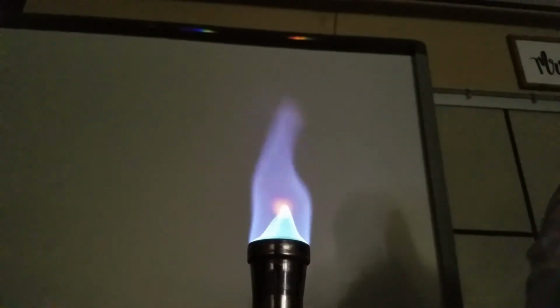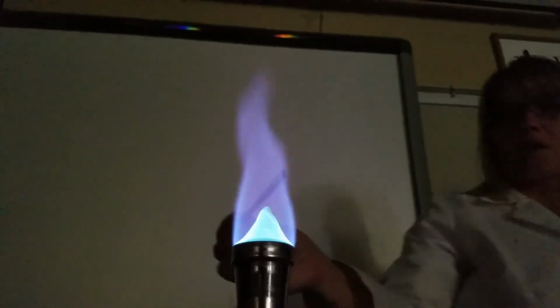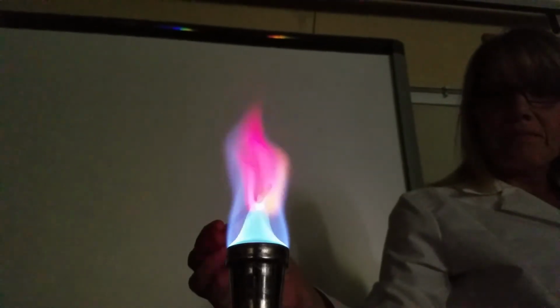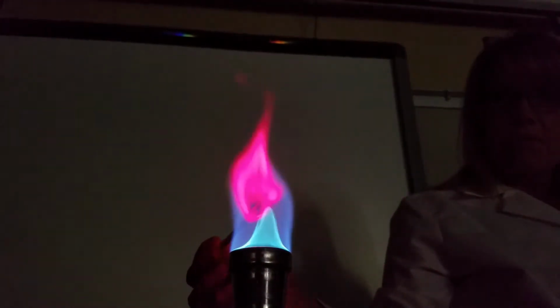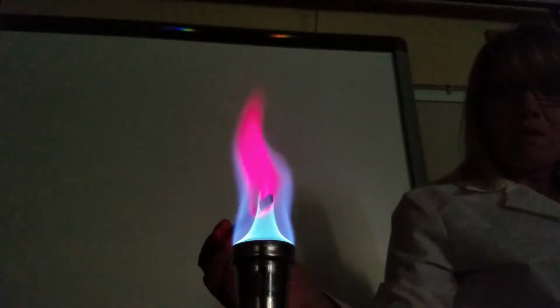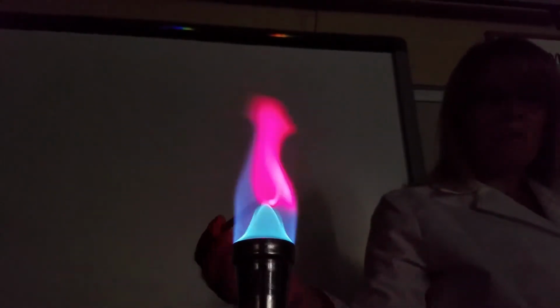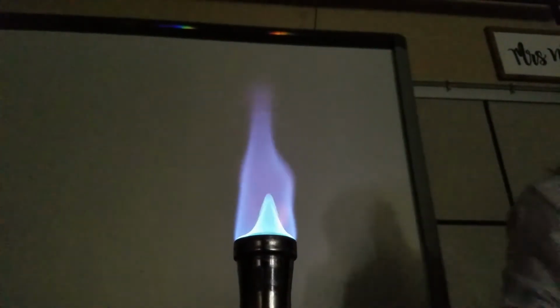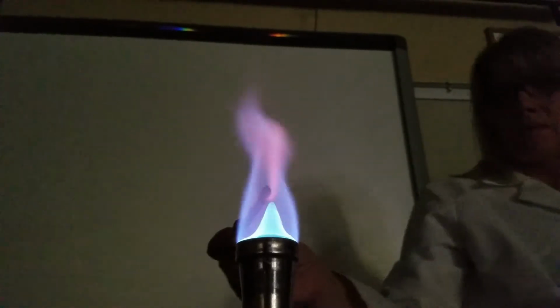Okay, stick number 4 is lithium chloride. Watch this one. Write down what you see. The 5th one is potassium chloride.